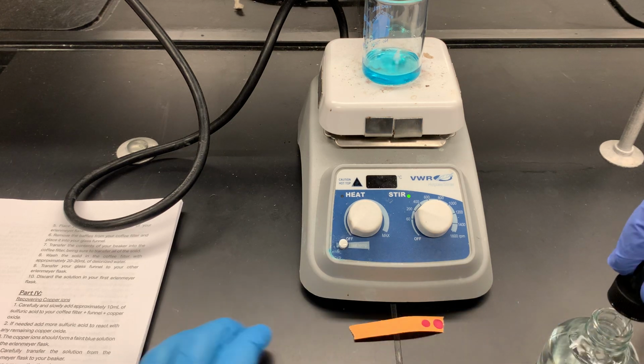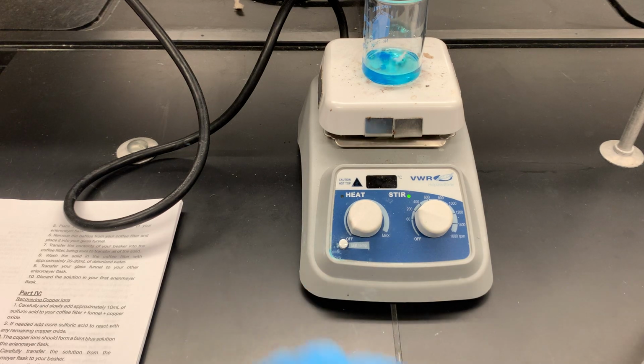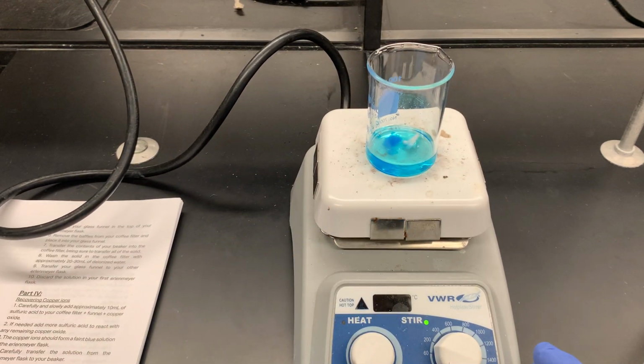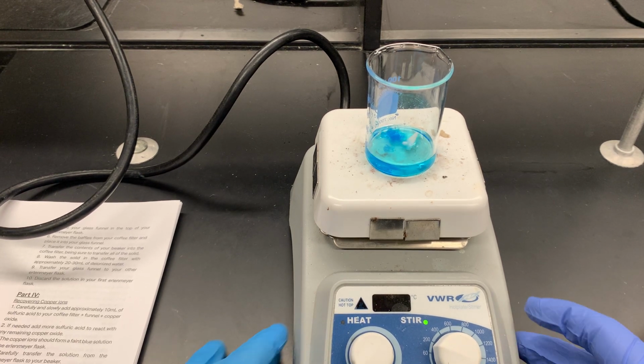So now I'm going to go back and I'm going to do maybe 10 drops. 1, 2, 3, 4, 5, 6, 7, 8, 9, 10. And if you look closely again, we have that solid forming. So there's more of that solid. So there is a reaction taking place. We have this copper hydroxide that's precipitating.